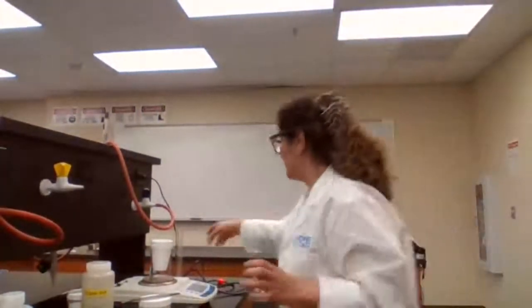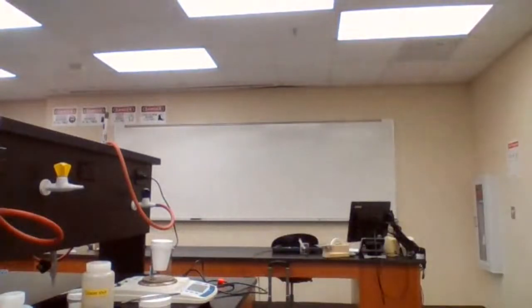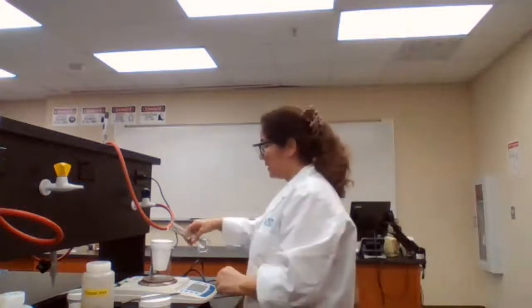I get the 50 ml of HCl. We add 50 milliliter HCl and measure it again.